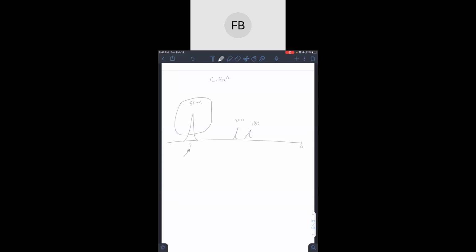So what a peak there represents is an aromatic ring. Oh, okay. That has 5 hydrogens coming off of it. So what does that tell us? Honestly, I don't really know. I'm kind of lost. Okay, well, it says that there's 5 hydrogens coming off the aromatic ring. So that means that everything coming off of it in terms of carbons and stuff is only coming off of this 1 carbon. So that's a place where it's important to start, or important to recognize that.